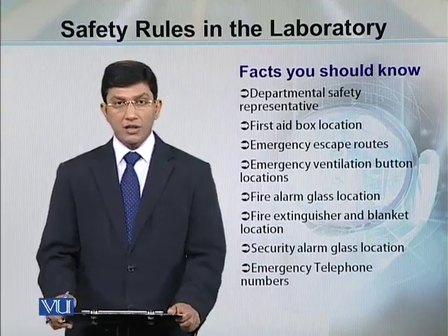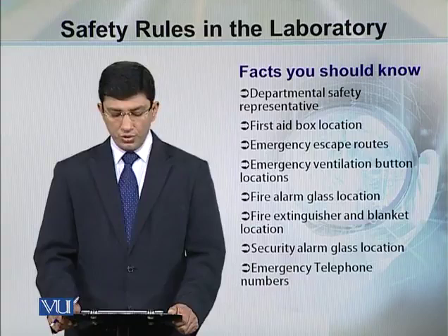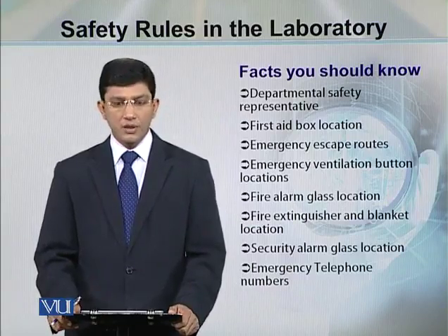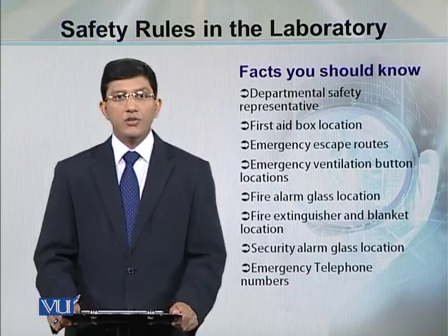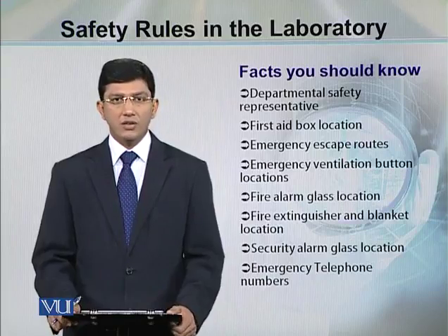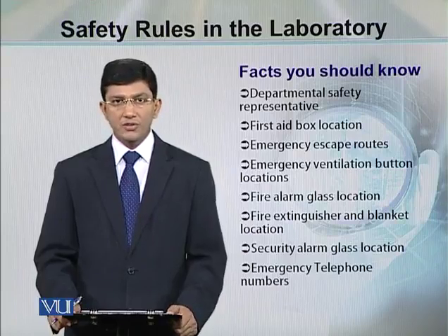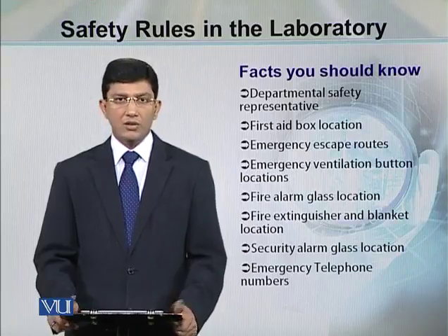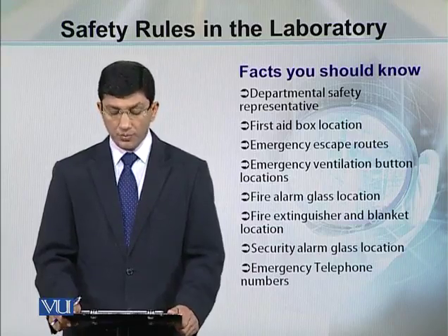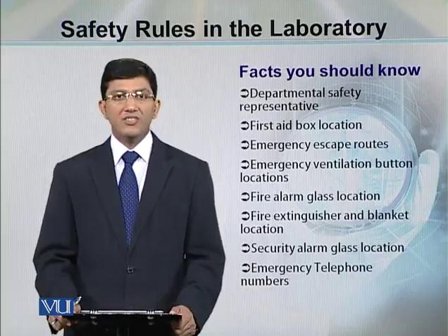While working in the laboratory, you should know certain facts. You should know who is the departmental safety representative. Be aware of the location of first aid box. In case of emergency, in case of any accident, you may need it. And you should have some proper training of first aid exercise in order to help someone else during this accidental situation.